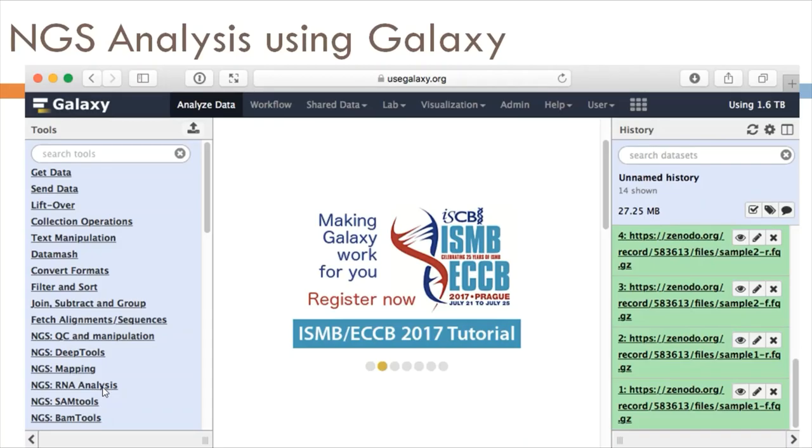You don't need a Linux computer to do this work. All you need is a laptop, and a browser on that laptop. Get the user access, which is also completely free, and the data is also free. Within a small set of clicks, it's possible to do the analysis.